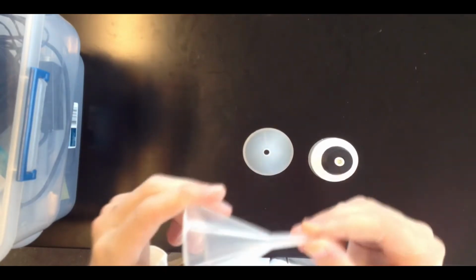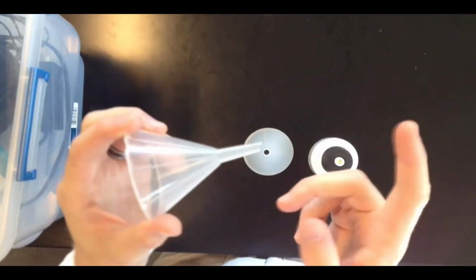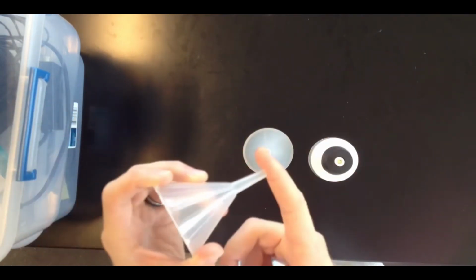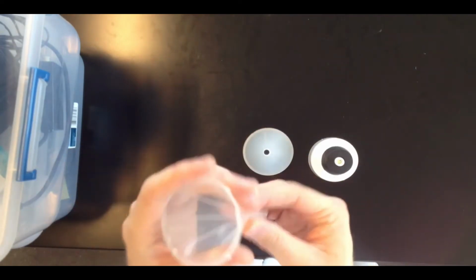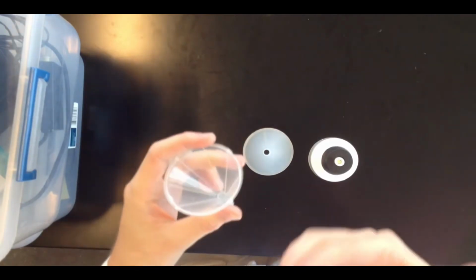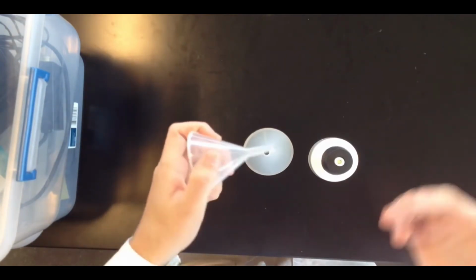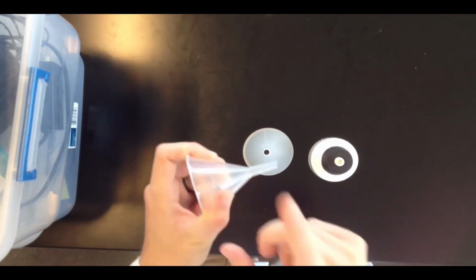This is called a burette funnel because it's most commonly used for transferring liquids into a burette, which is a really long and thin piece of glassware. And so the small opening on the burette funnel is perfect for transferring liquids into a burette. The burette funnel can also be used to transfer liquids into something like a volumetric flask during solution preparation, but the key thing to remember is that the burette funnel should be used for transferring liquids only.